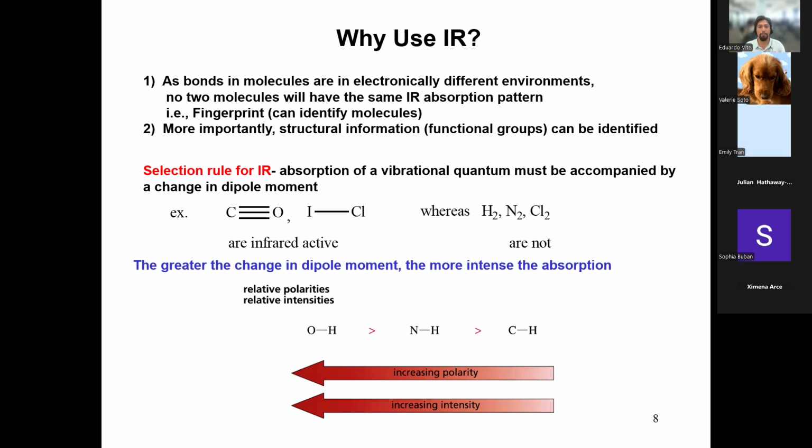We also do NMR, but NMR tells you more about the specific spin of the hydrogen atom. You guys will learn all about that next semester. There's no need to get into it. But again, we use IR specifically because that tells us the vibrations of the functional groups in the molecule, and it gives us a hint as to how we can identify the molecule. So far, we've used TLC. So far, we've used column chromatography. Well, now we can use direct methods to directly conclude what atoms are present in the molecule. That is the cool thing about IR.